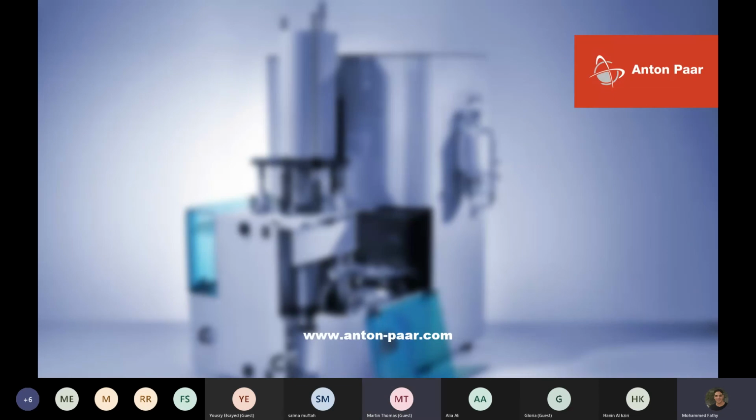But you're going to empty the penetrometer through some filter. What you want to do is catch the sample, okay? You don't want your sample to be in your mercury bottle. You want your sample. Now, if it's a core sample, that's really easy, right? You can just pick it out. If they're small pieces, you might have to go through a filter, okay, just to catch them. You do another rinse down with alcohol, and then you basically rinse down your sample with alcohol.